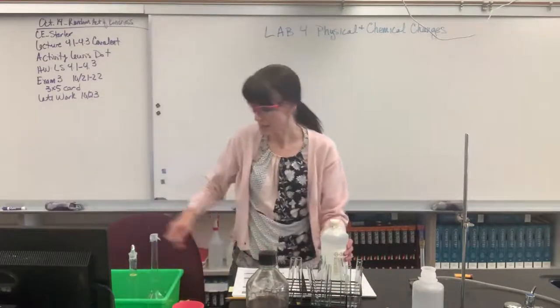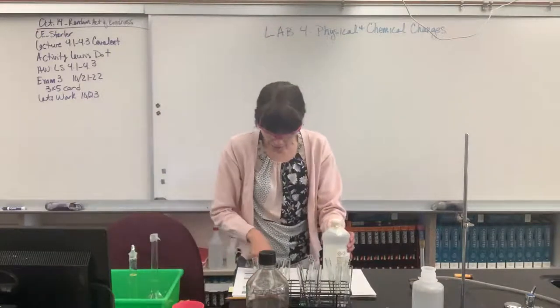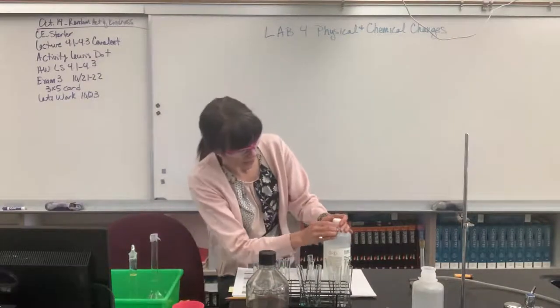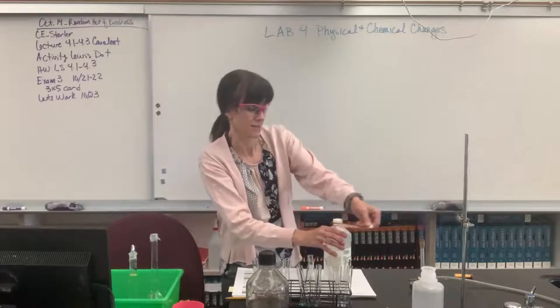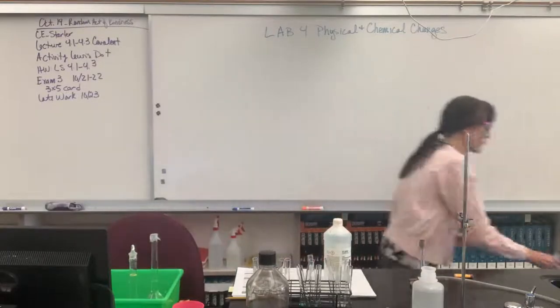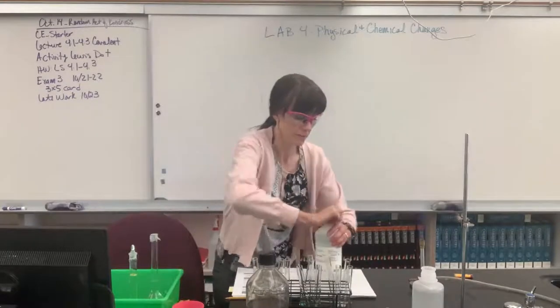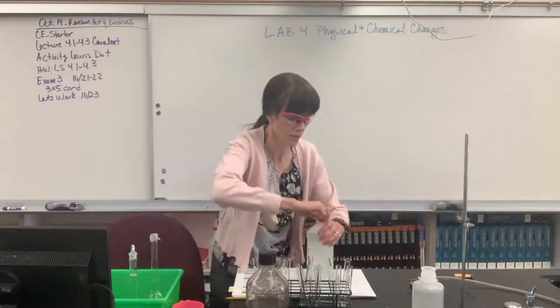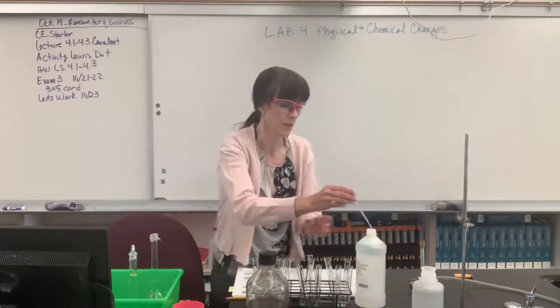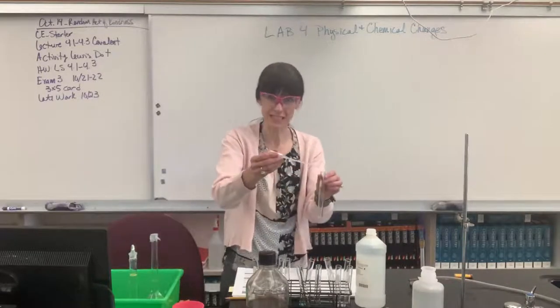Okay, I'm going to get a new little pipette for my hydrochloric acid. And it wants us to put 15 drops. Let me open this. Gotta use muscles, you guys. Let me undo the tape on this. Nice. Now I can open it. There we go. So I've got my pipette, and we are going to drop 15 drops of 6-molar HCl.